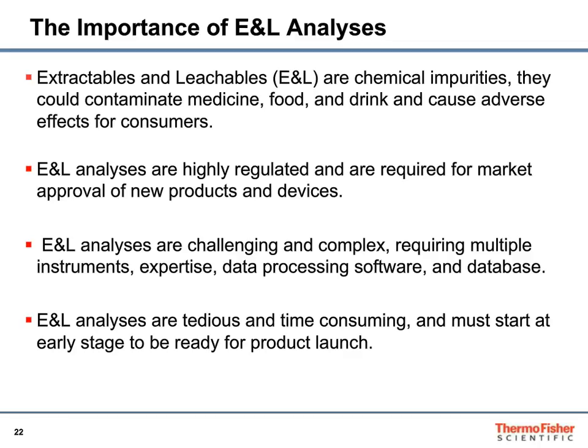And also E&L analyses are highly regulated. They are required for market approval for any new product or device. And E&L analyses are very challenging and complex. They need multiple instruments, techniques, and also expertise to do the data processing and analysis. Therefore, we need adequate software and database.